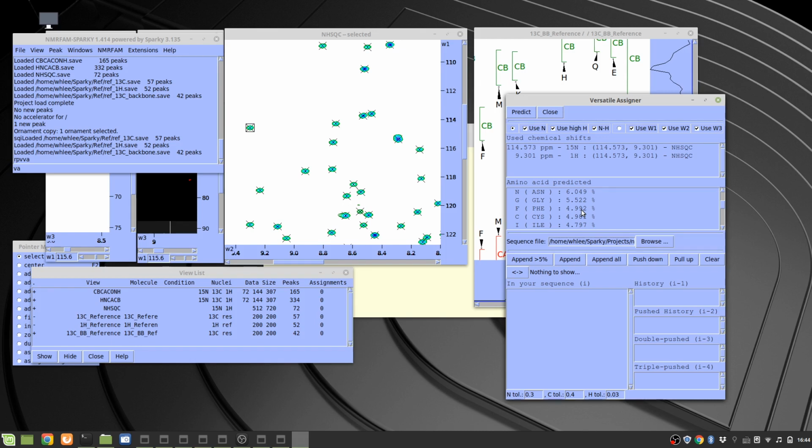As you can imagine, there are 20 kinds of amino acids, so you always have to be doubtful about predictions which are over 5%. A prediction probability higher than 5% means it has a slight edge over the others, because if you divide 100% by 20 kinds, it's going to be 5%. So if it is higher than that, then it's likely.